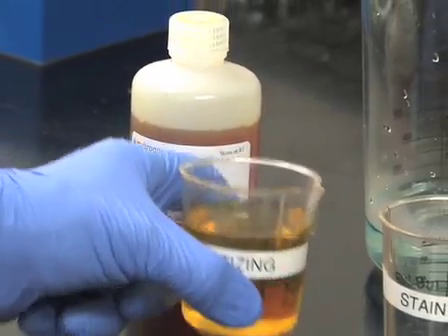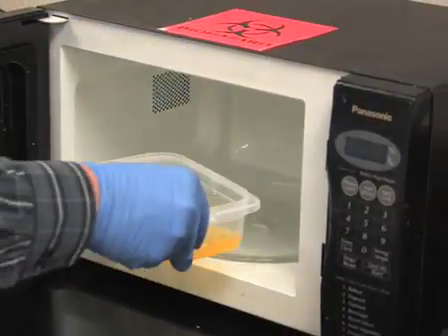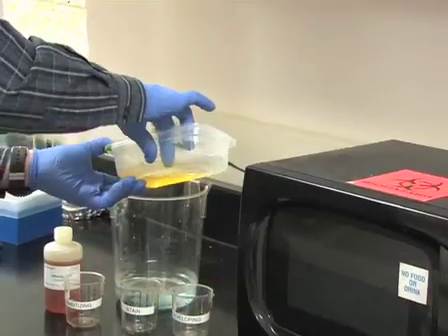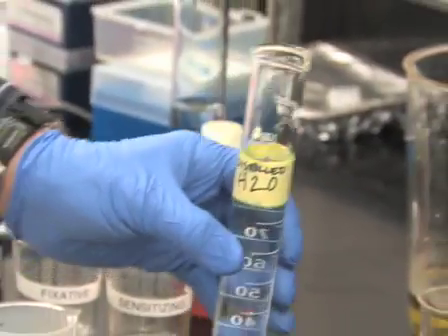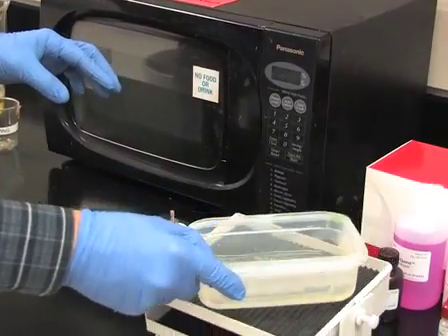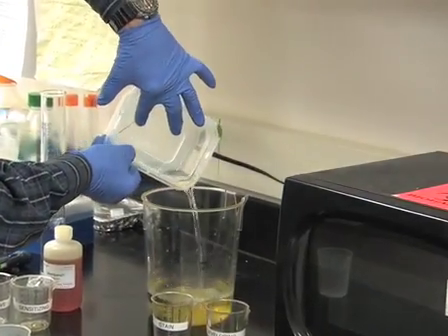Now add 100ml of sensitizing reagent. Microwave for 30 seconds and then place on a shaker for 2 minutes. After 2 minutes, pour off the sensitizing reagent. Add 100ml reagent-grade water, microwave for 30 seconds, and place on a shaker for 2 minutes. Pour off and repeat for a total of 2 wash cycles.